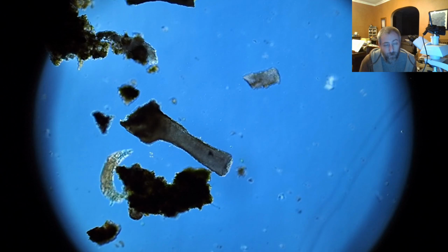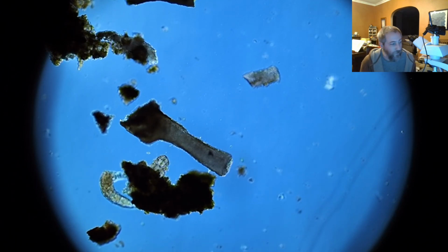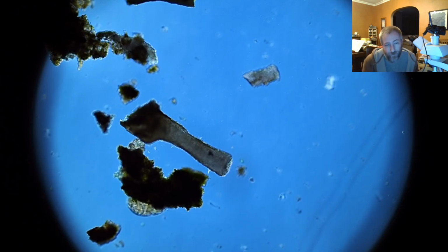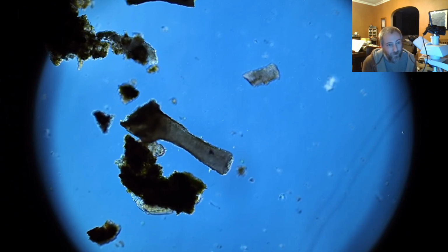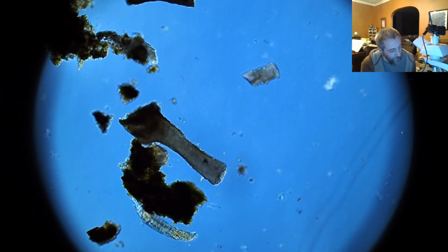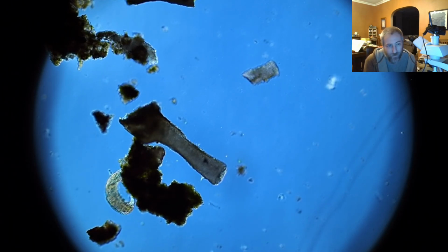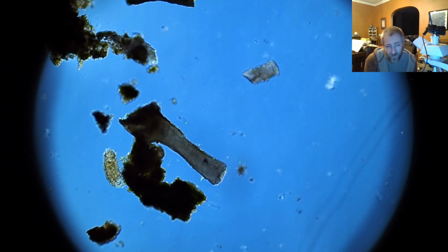The expensive part of this microscope is actually things that you can't see, which is that these objectives have differential interference contrast, and so I think you could probably buy it without that for something like $12,000 or $15,000. I mean, it's like a car, right?